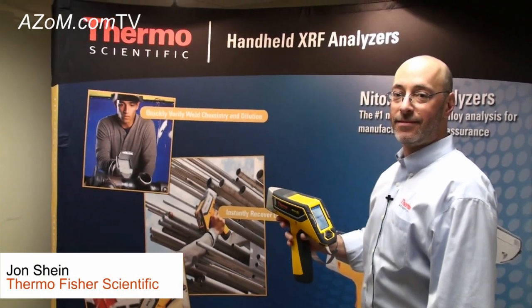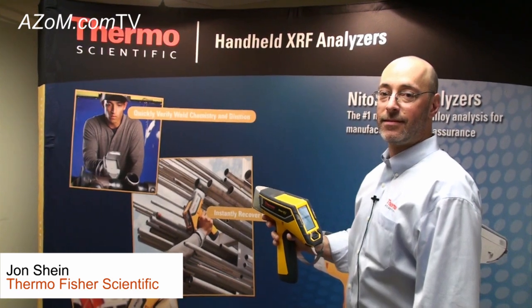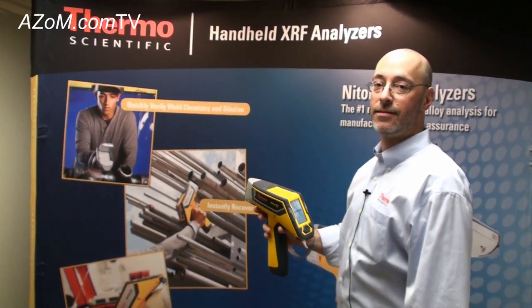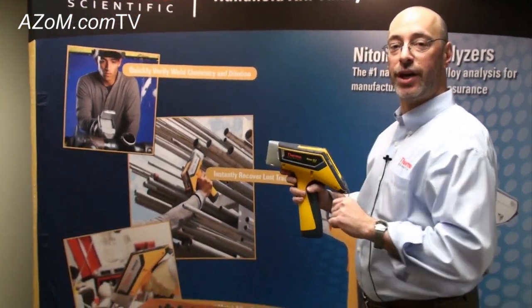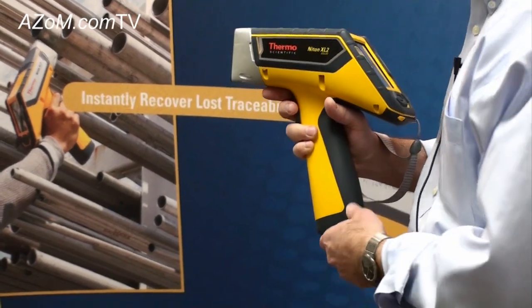This is Cameron Chai from AZoM.com bringing you another episode of AZoM.com TV, and today we're speaking to John Sheen from Thermo Fisher Scientific, who's going to run some precious metal demonstrations for us. Thanks, Cameron. What we're going to do is show you how the Thermo Scientific Niton XL2 is used to analyze a couple of different samples of gold jewelry.